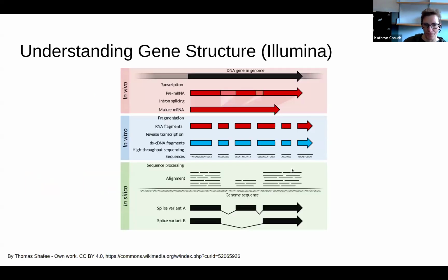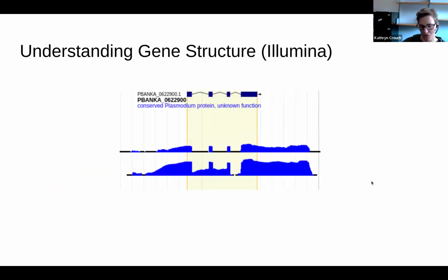Okay, so just to remind you of this again, we have our reads and we've aligned them to a genome. So there's a schematic of what this looks like here. If you load your alignment into JBrowse, you're going to come up with something that looks like this. And I apologize, these are genes that are actually not from a fungal organism. Please ignore that. It's just because I happen to have these slides from a different lecture. The concept is exactly the same in fungi as well.